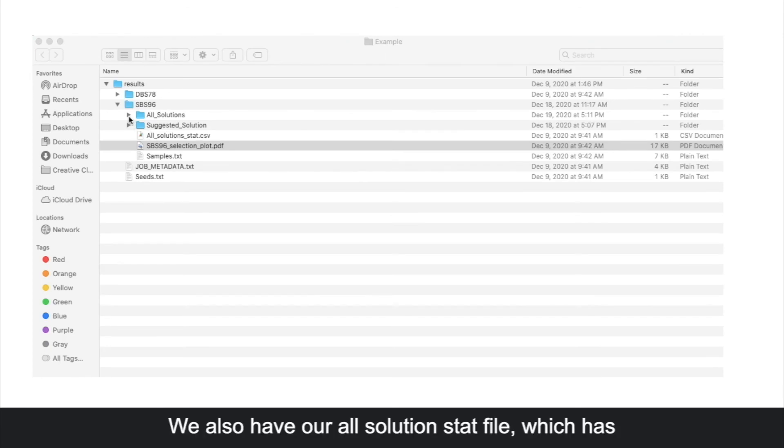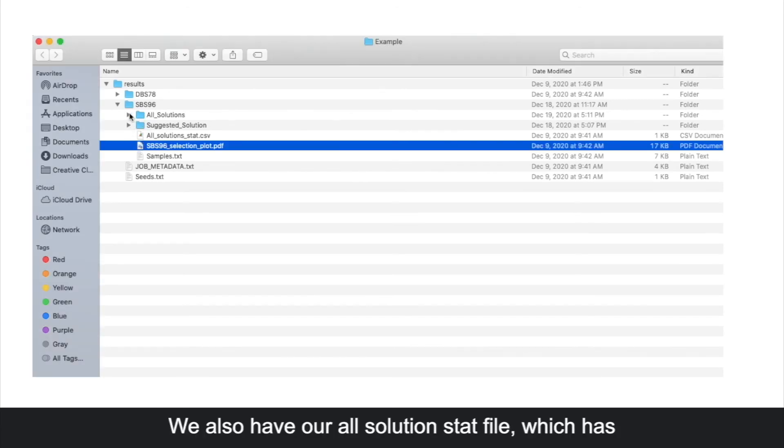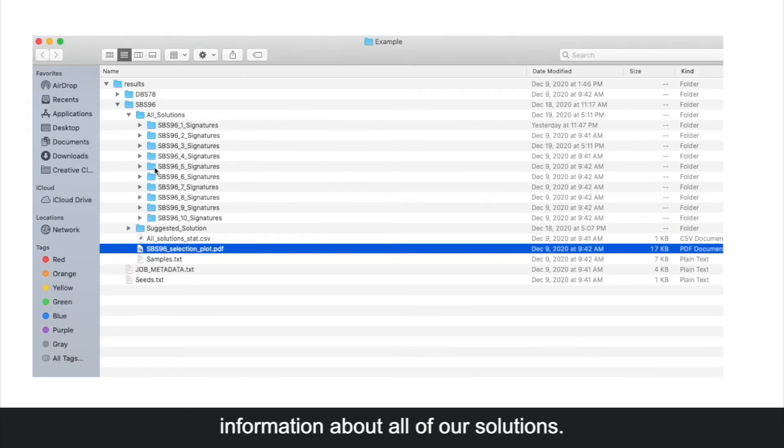We also have our all solutions stat file, which has information about all of our solutions.